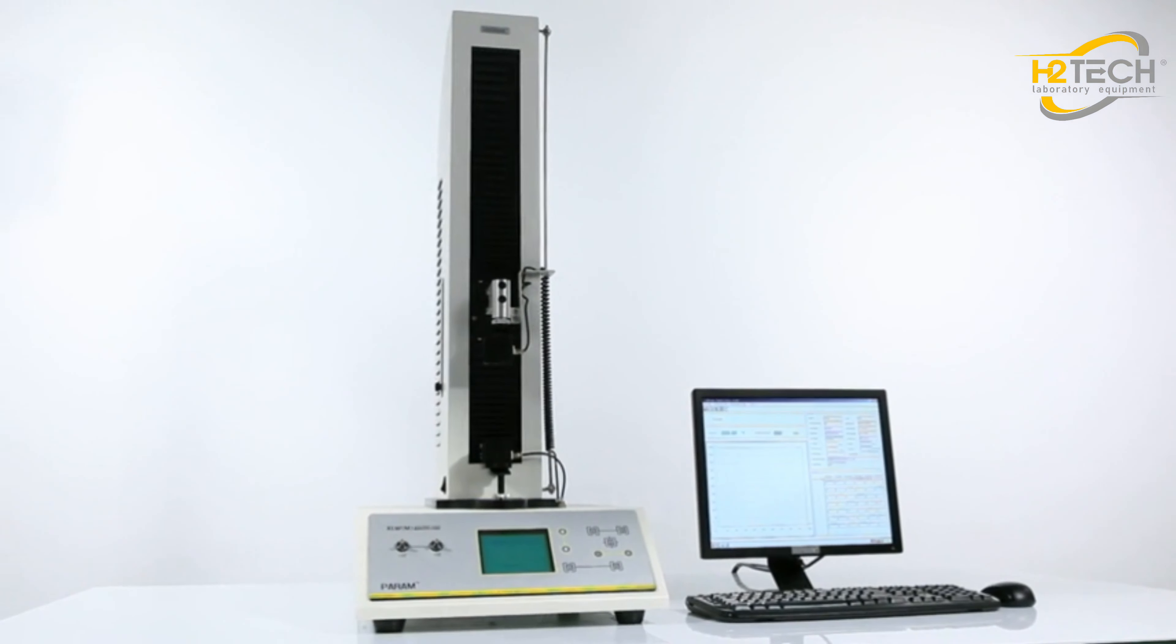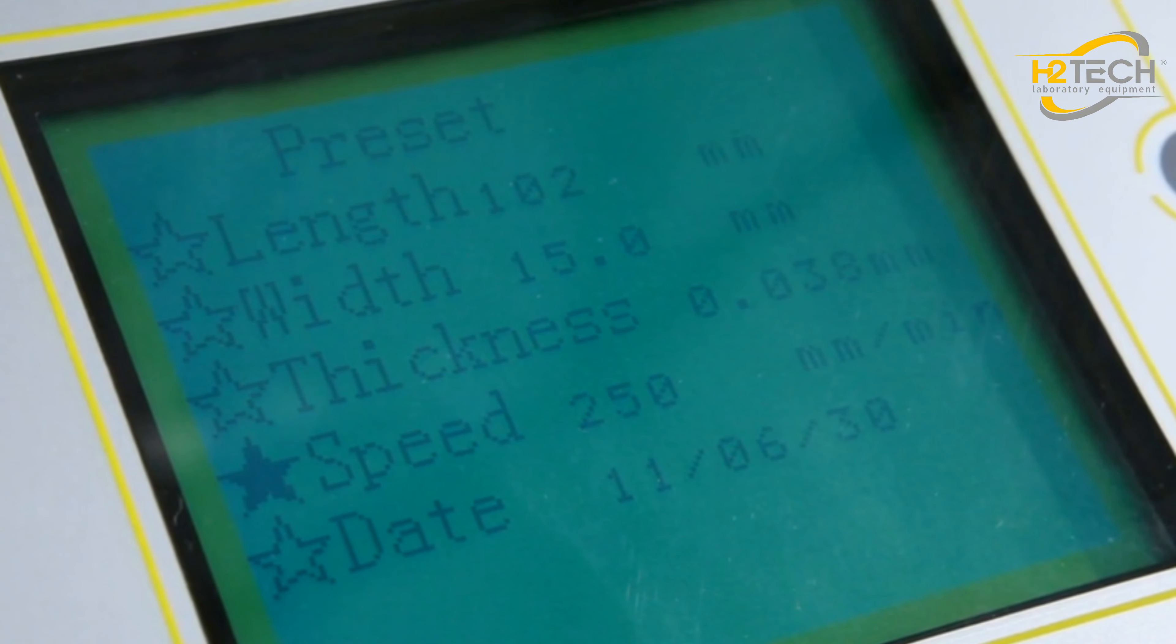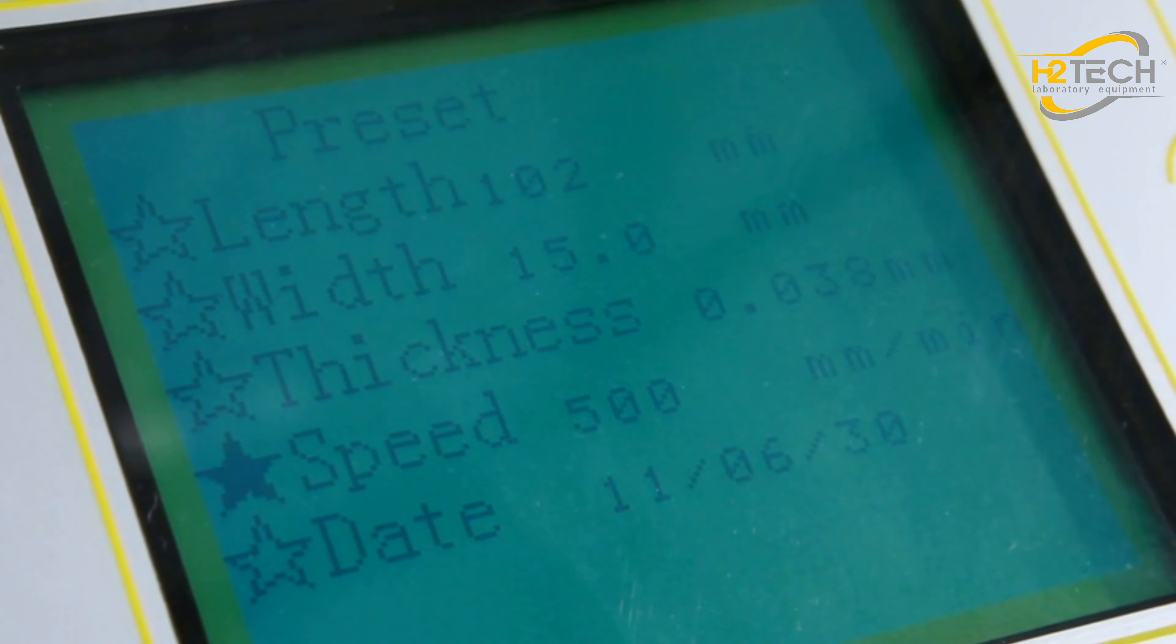XLWM is LabThink's basic automatic tensile tester. The instrument can perform tests at seven different testing speeds to meet different industry standards.